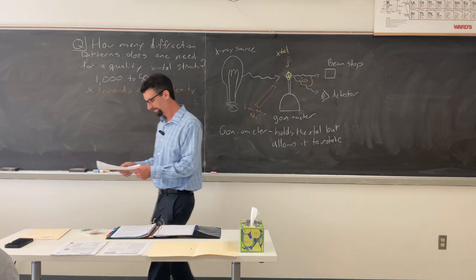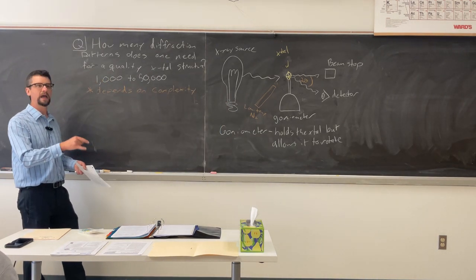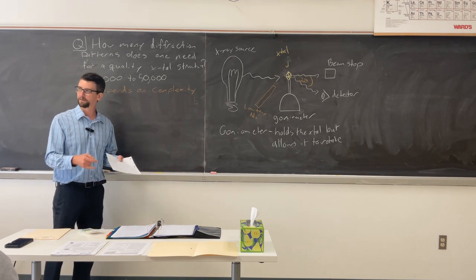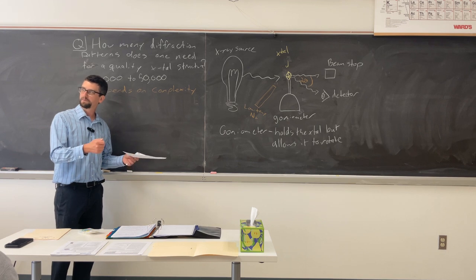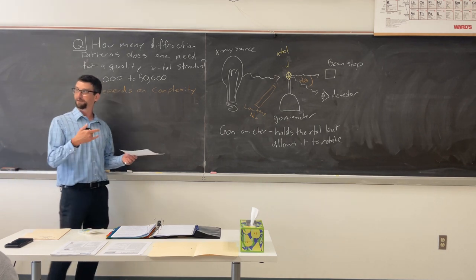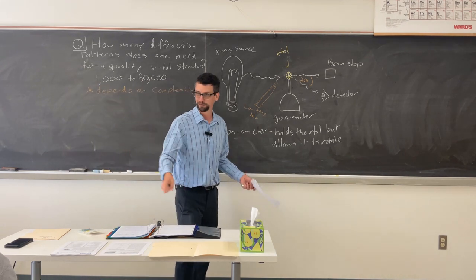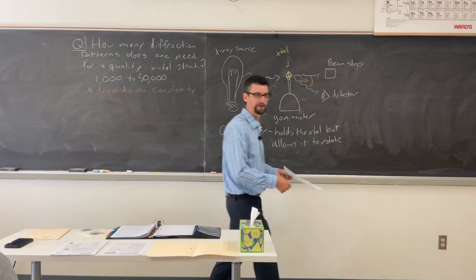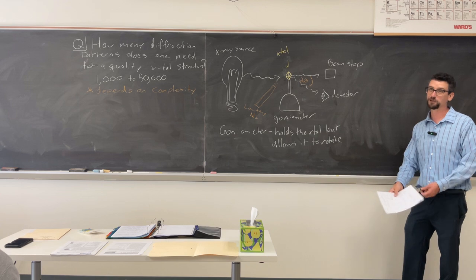That's interesting. So back in Fredonia, we had one of these in the basement, and it legitimately used film. It did have another detector on it that got added on later, but the first one that they had used film, Polaroids. There were Polaroid pictures, just like that diffraction pattern right there. And they used to use that to solve this stuff, which is amazing.